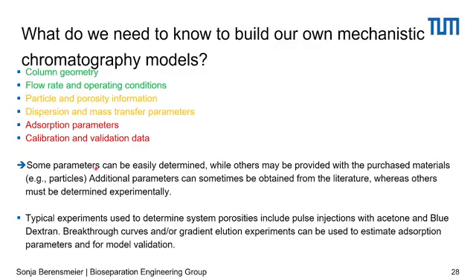Okay, as a last few points, I want to talk about what we need to know to build our own mechanistic chromatography models. Also, when we in the next screencast are going to be looking into mechanistic models, what do we need to know about our system to actually build a mechanistic model? I color coded some of these parameters depending on how easy they are to determine. Red being more complicated than green.